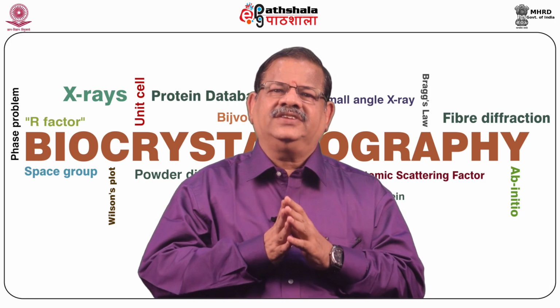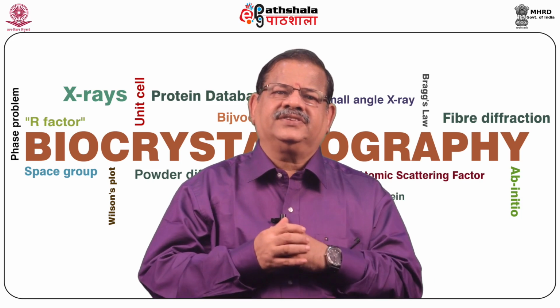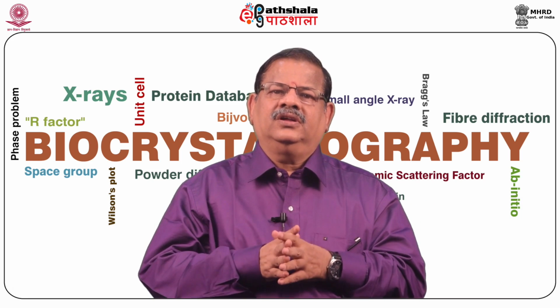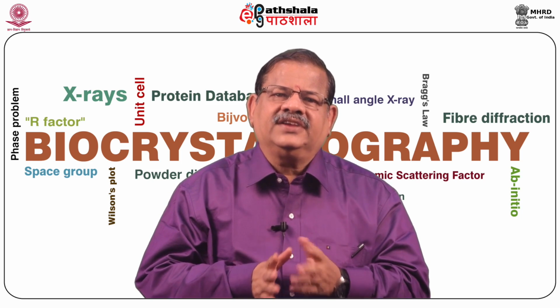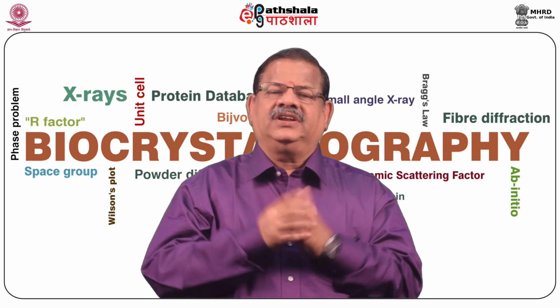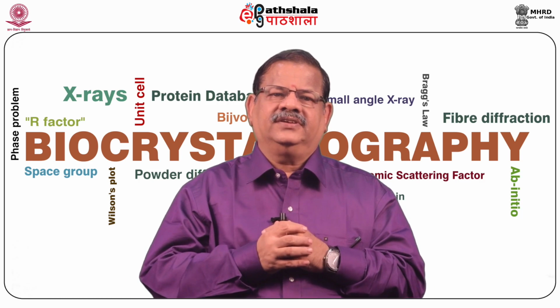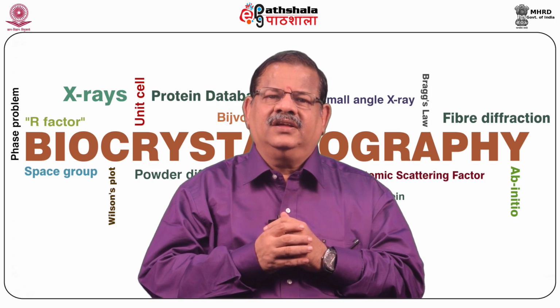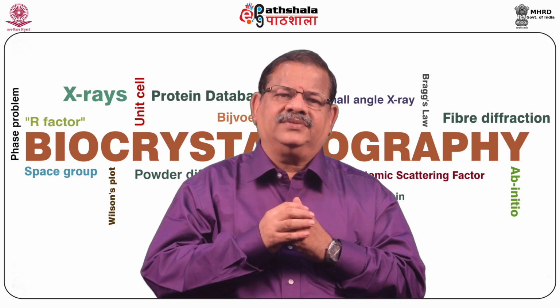The current Phenix release includes graphical user interfaces, GUIs, for phenix.refine, phenix.xtriage, AutoSolve, AutoBuild, and LigandFit wizards, the restraints editor REEL, all of the validation tools, and several utilities for creating and manipulating maps and reflection files. Interfaces for automated molecular replacement, the AutoMR wizard, and Phaser are also now available. Let us analyze the above programs in a detailed manner.